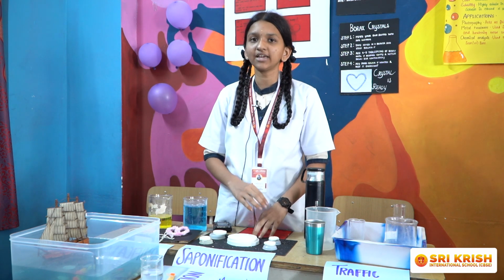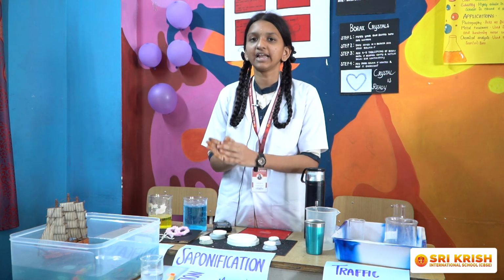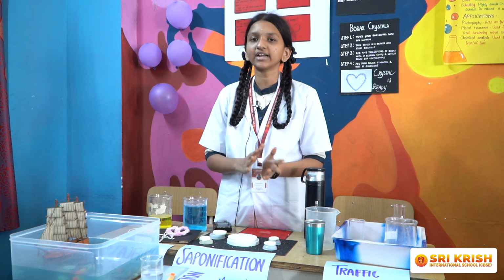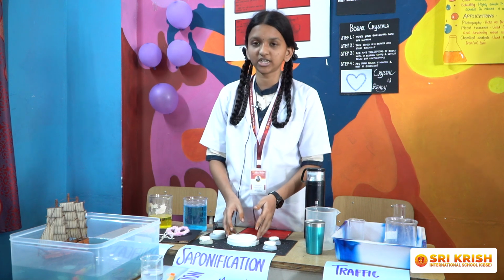After that leave the solution undisturbed for some time. Then after a few hours the solution becomes thick and white in color, and you can transfer that to a mold. After 8 hours you could see the formation of soap.